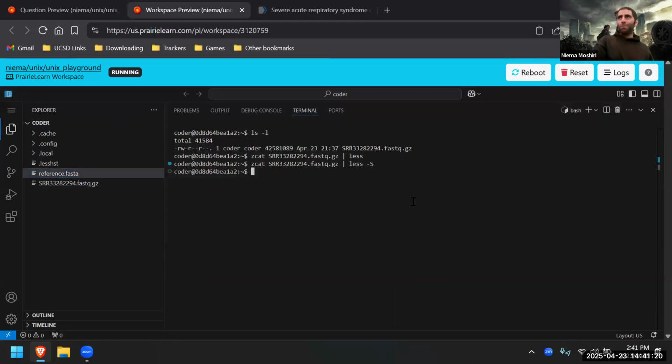Okay, so when we have raw reads and we have a reference genome, what's the first thing that we do? Assuming that it's already trimmed, because we've already checked that these are trimmed reads. What's the first thing that we do? This was last week's topic. Any thoughts?